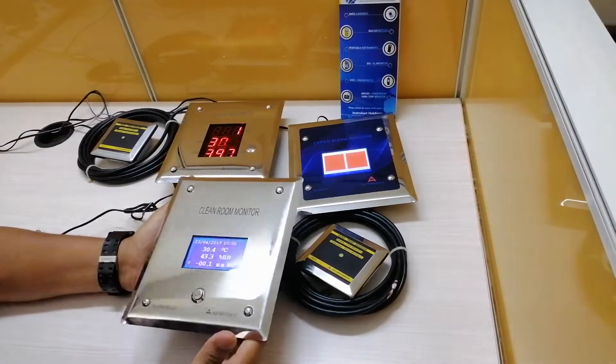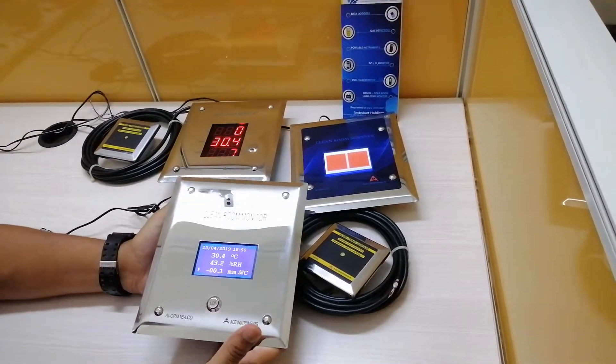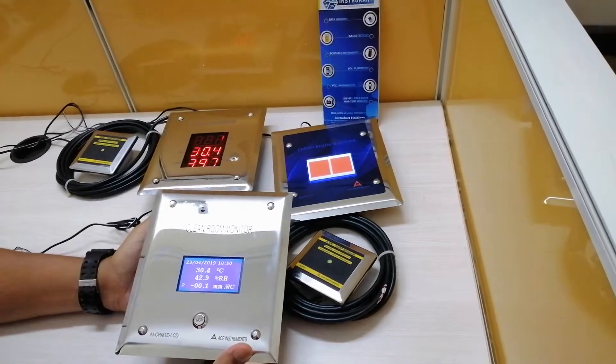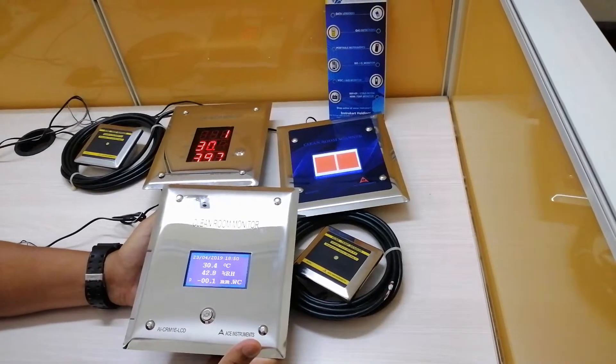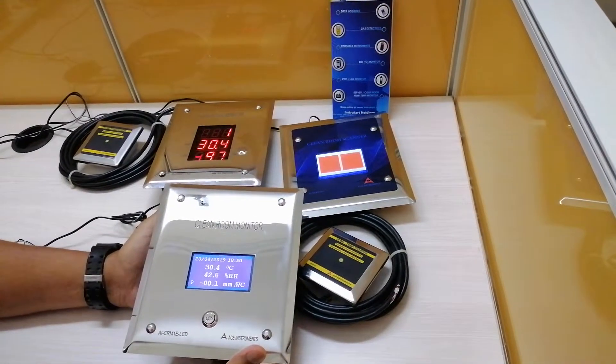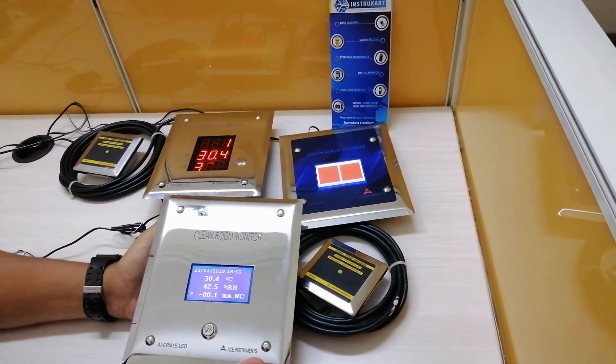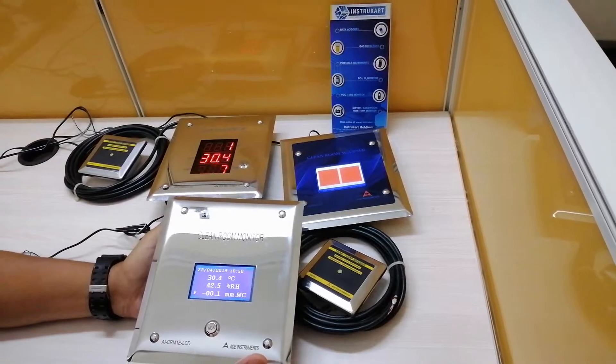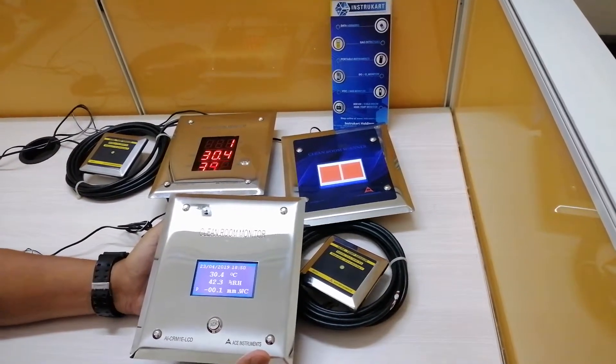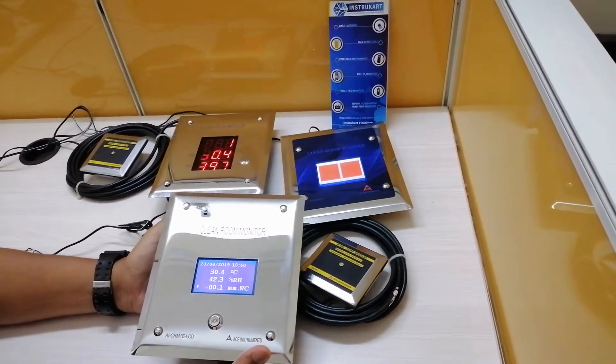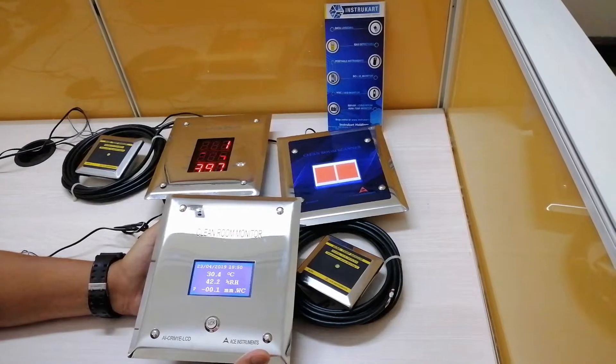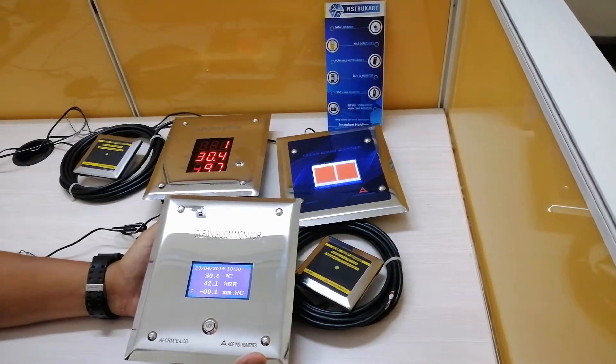The applications are mostly in clean rooms, hospital OTs and ICUs, and other temperature, humidity, or differential pressure sensitive areas.